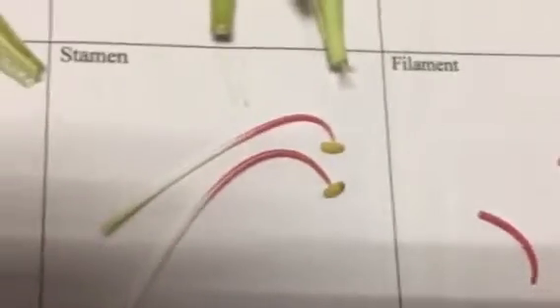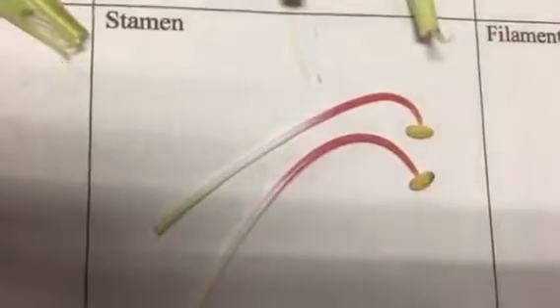Those are the filaments. Those are the stamens. Those are the anthers. Anthers are the male reproductive parts. Those are pollen. The yellow stuff is pollen. Those are called anthers, though.